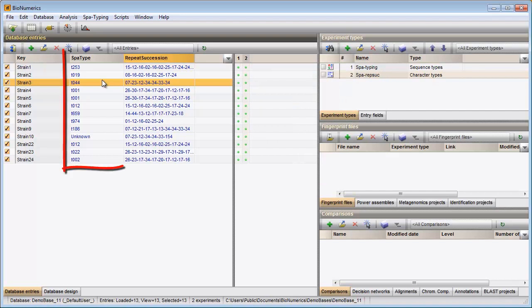The matched spot types are displayed in this information field. When the repeat information is currently not linked to a spot type, the text unknown is displayed.